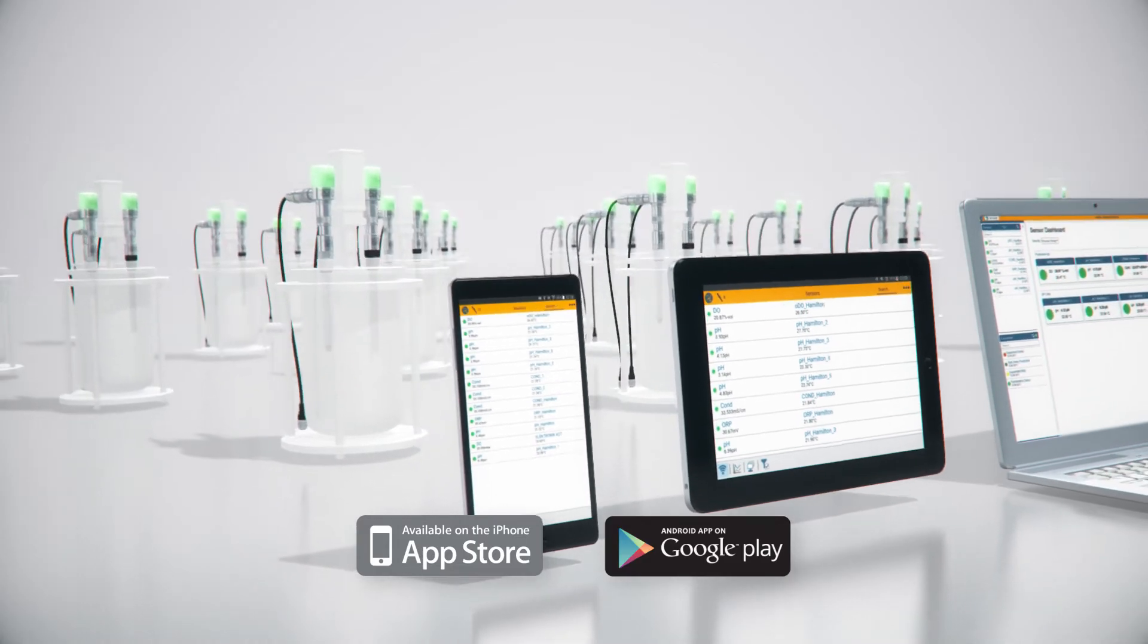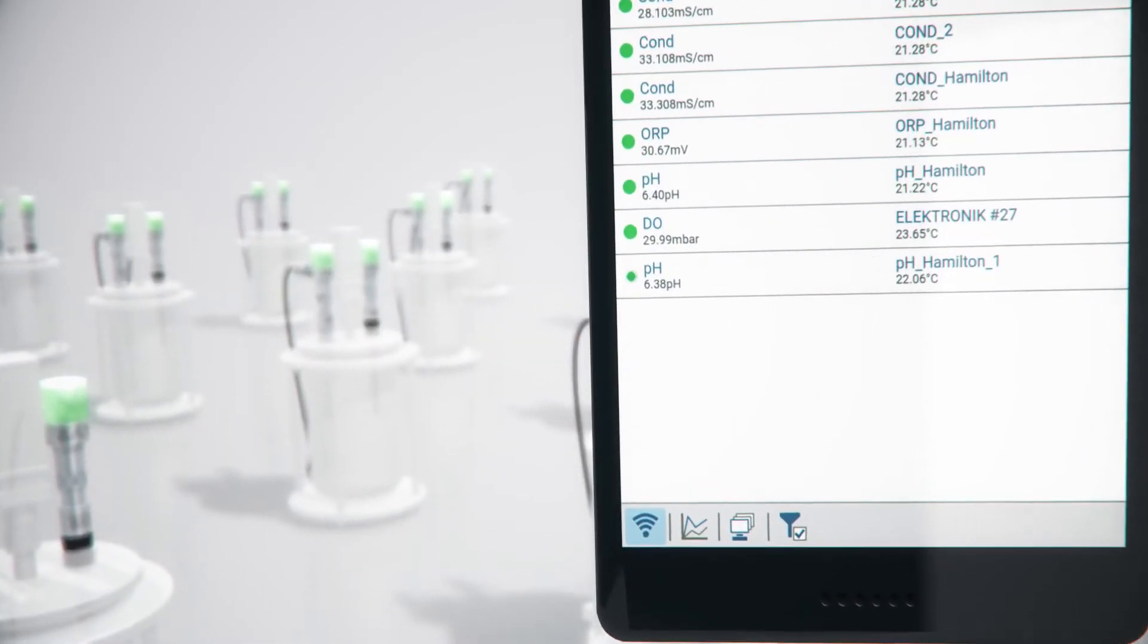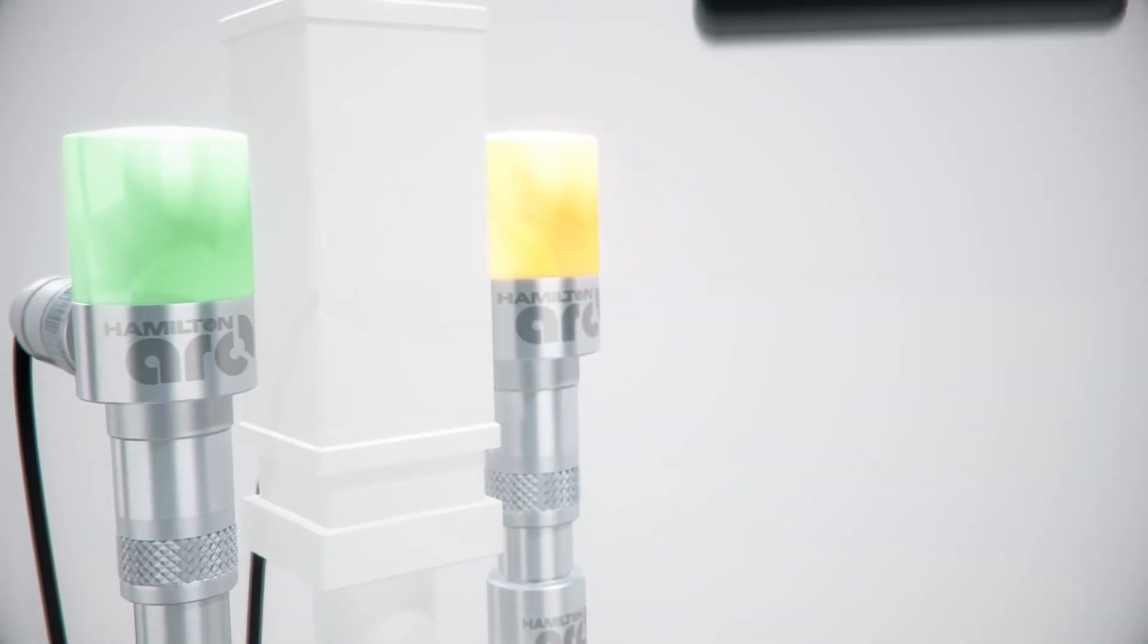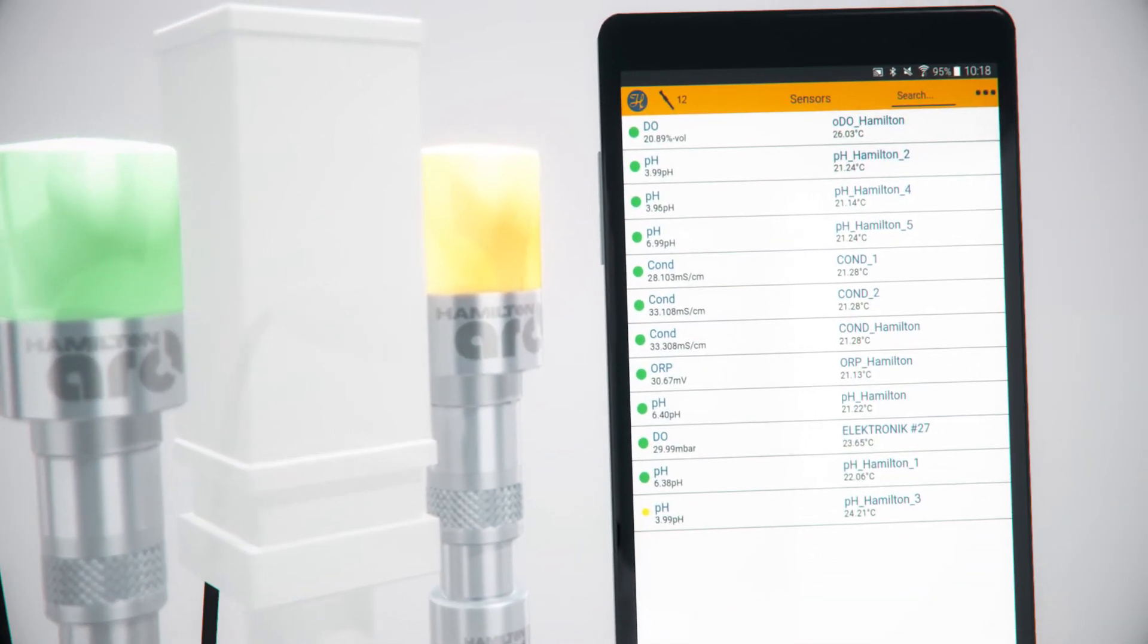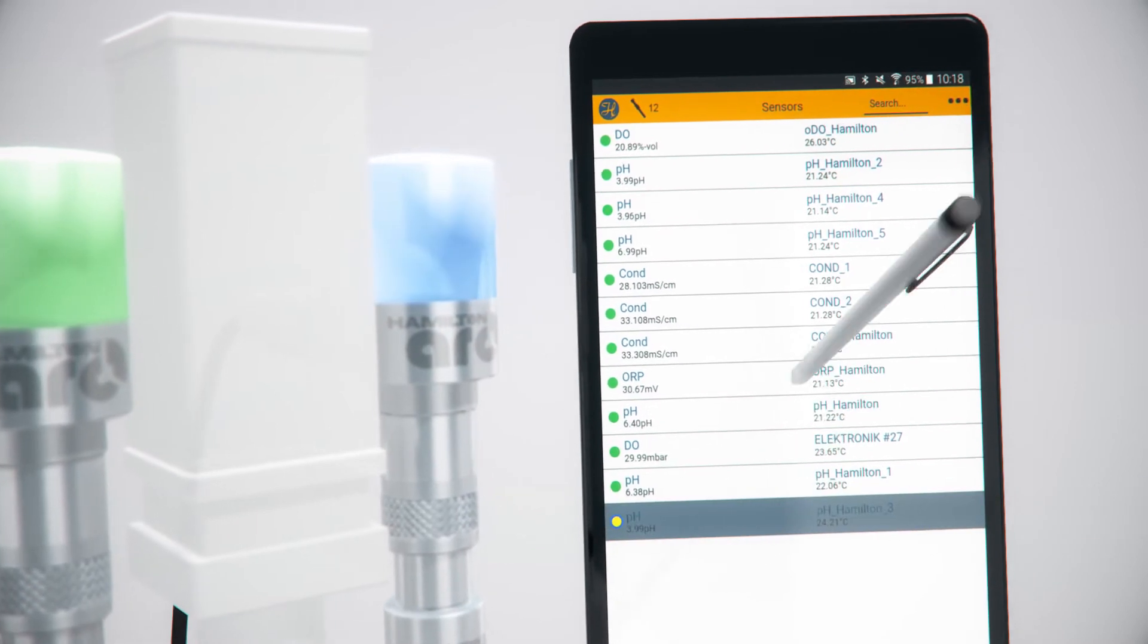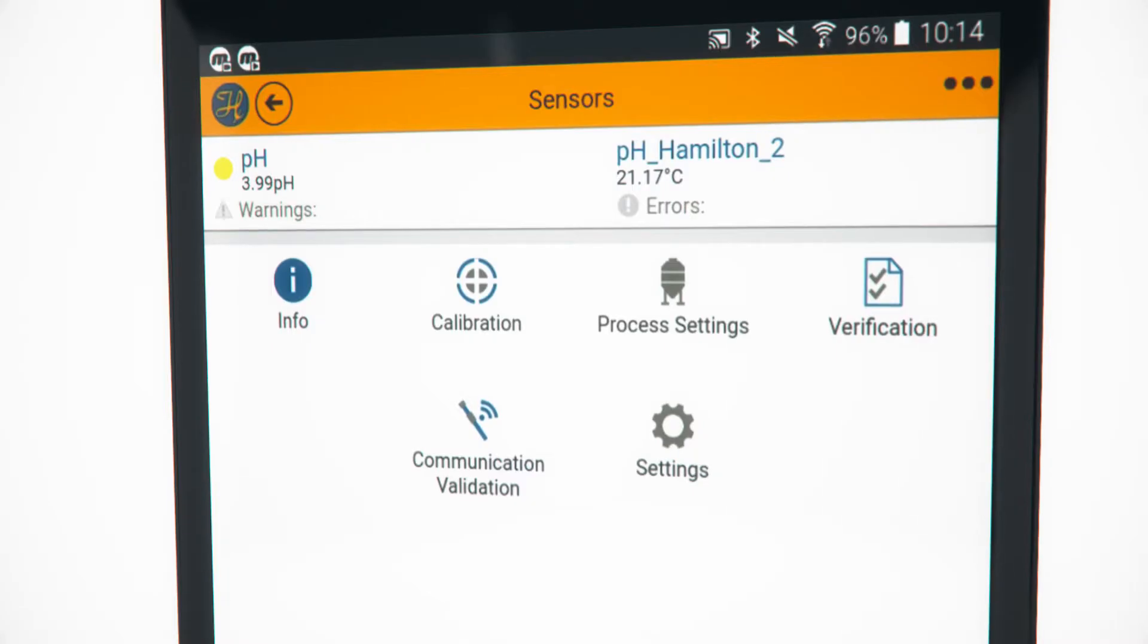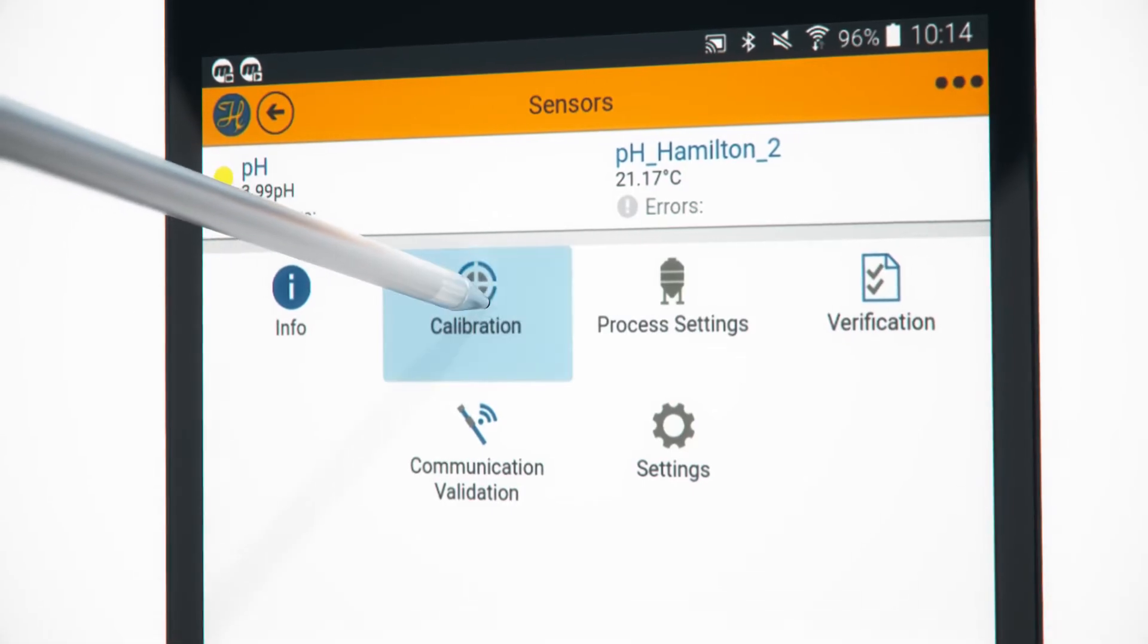The app makes diagnostics easy by quickly identifying sensors that may require attention. Easily bring your mobile device to the sensor with the colored indicator matching the app. Verify sensor status and begin diagnostics via Bluetooth communication.